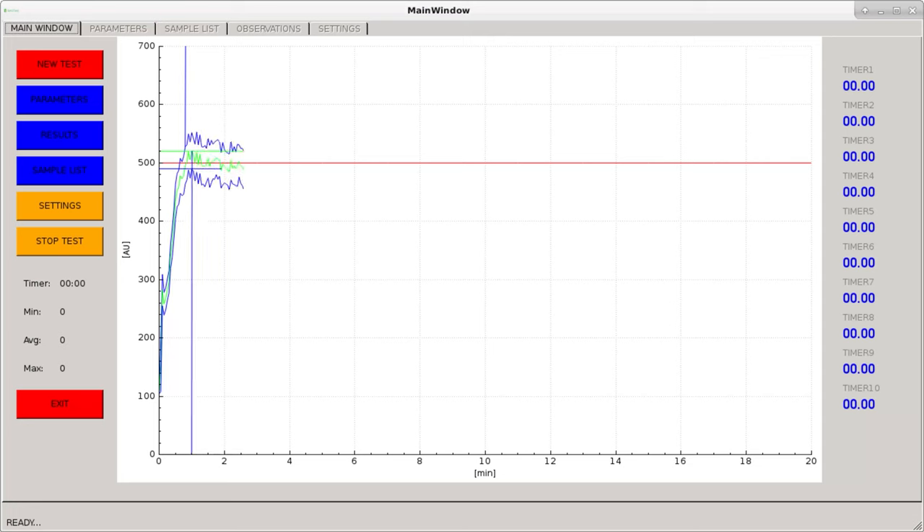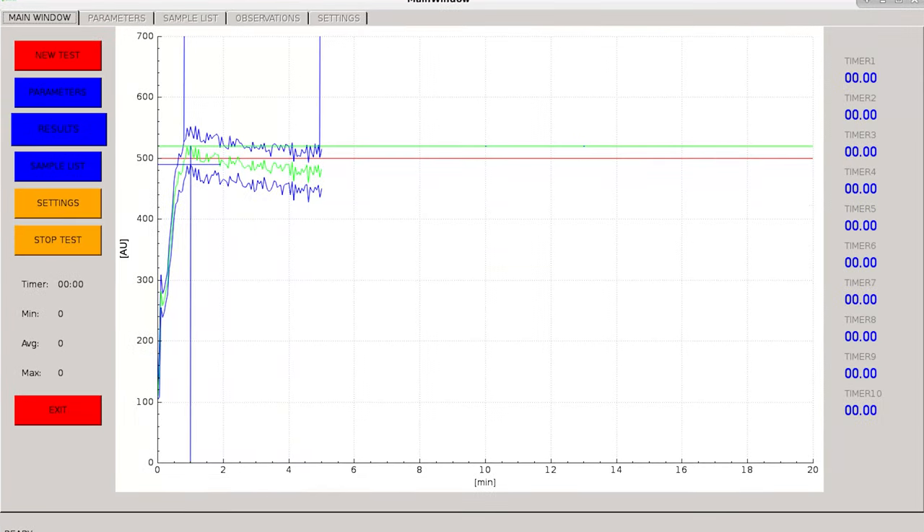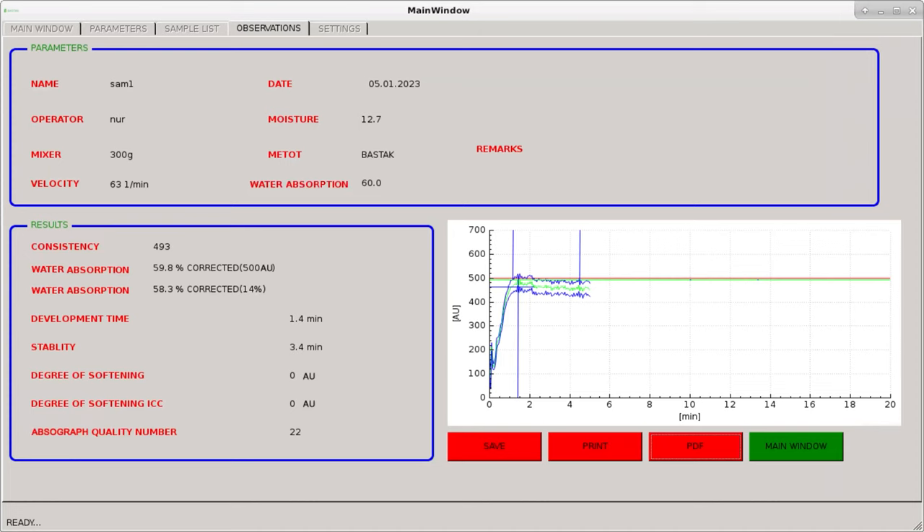The test time is 5 minutes in total and the device must reach the standard curve value of 500 AU. When the test is completed, the test-completed warning is displayed. By selecting the results indicator, the analysis result of the analyzed sample is displayed on the touch screen. The analysis result can be saved in the device memory as PDF, transferred to the computer, and printed out.